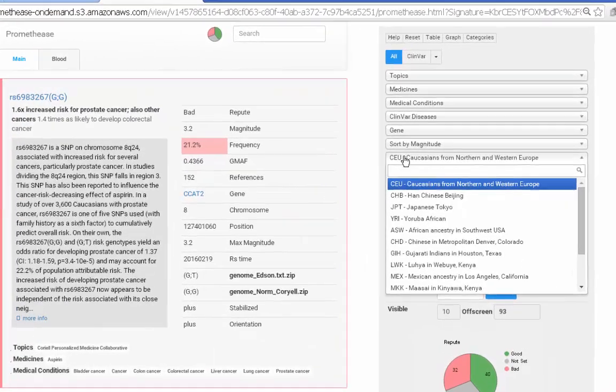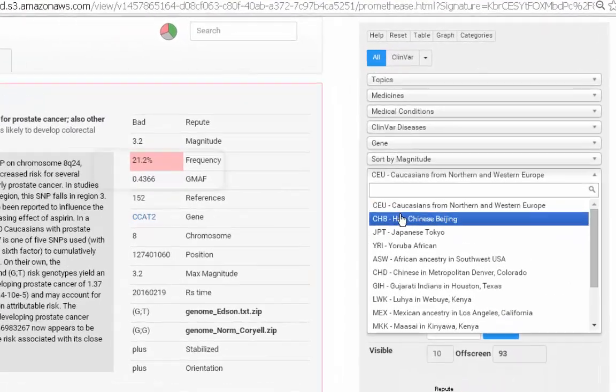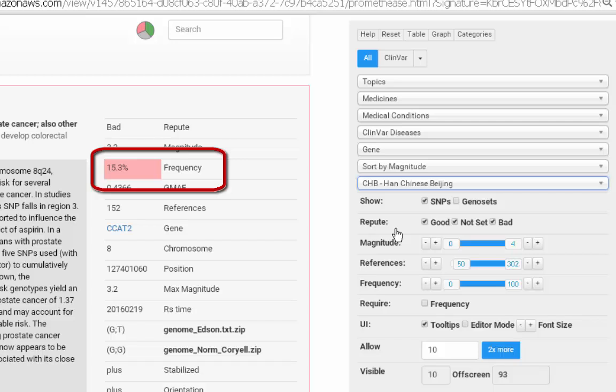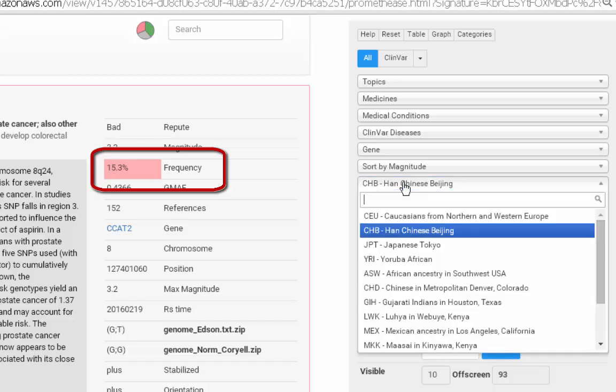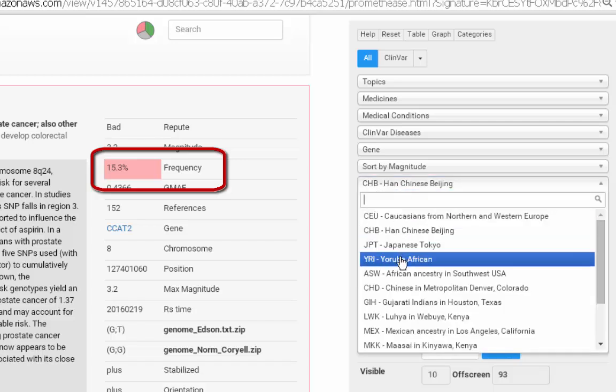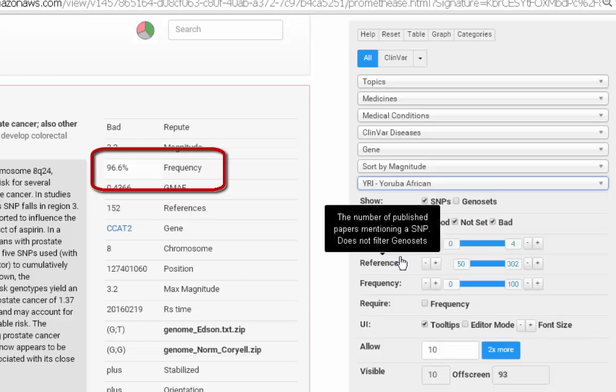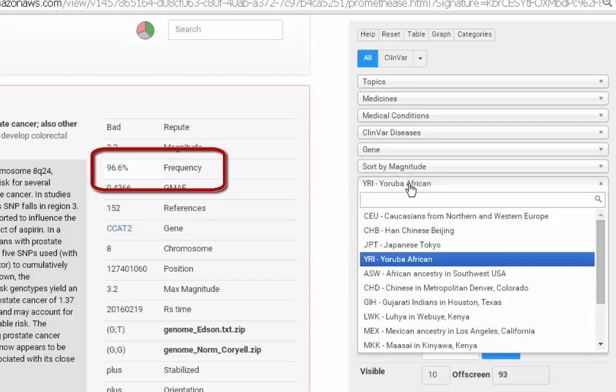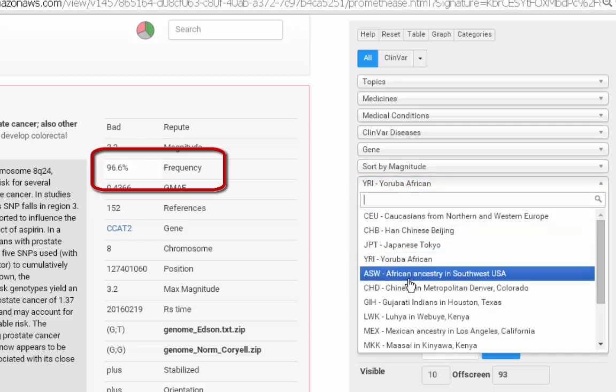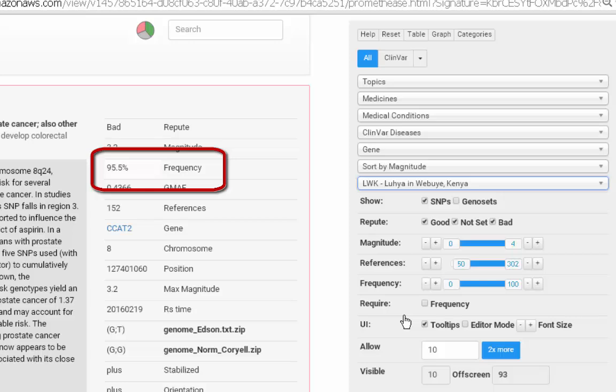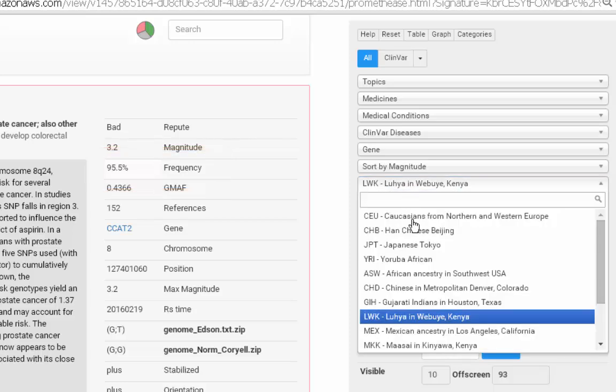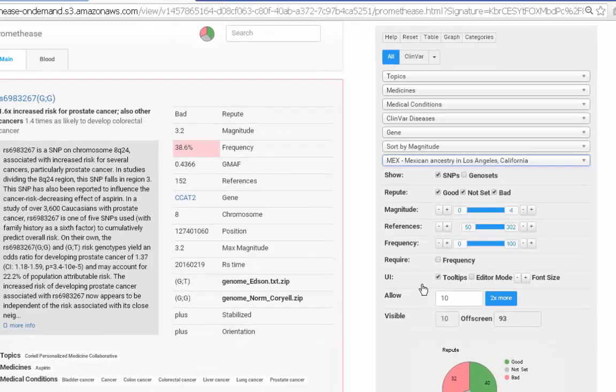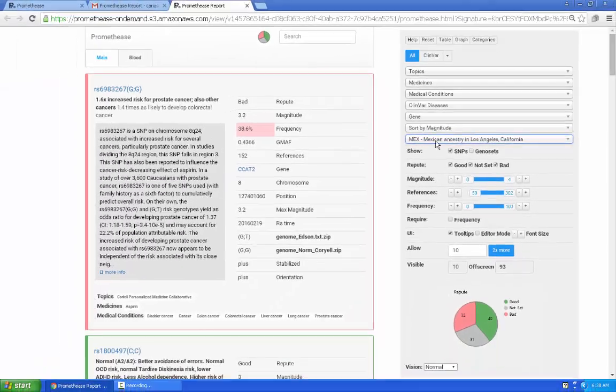It's now possible to choose different populations within your Promethease report. Each time you choose one, the population frequency updates. So for this particular genotype, you can see that it's extremely common in the Yoruban African population at 96%. When we choose something like Mexican, the population frequency falls much lower to 20s or 30s.